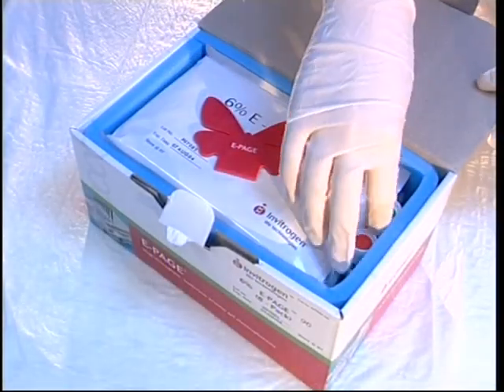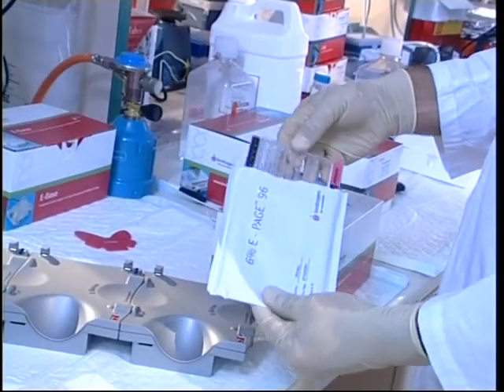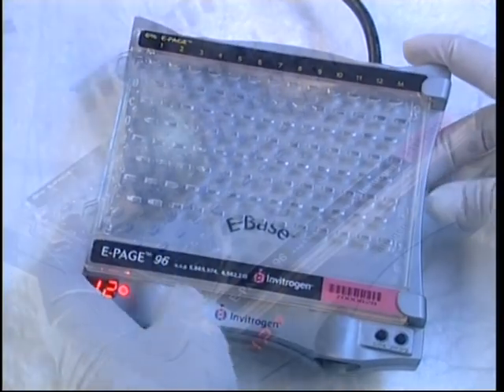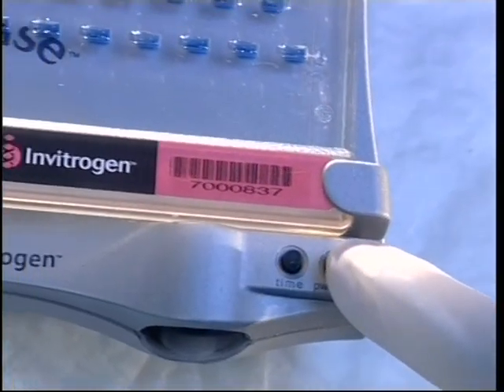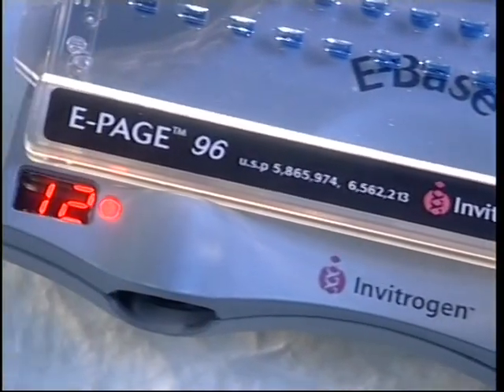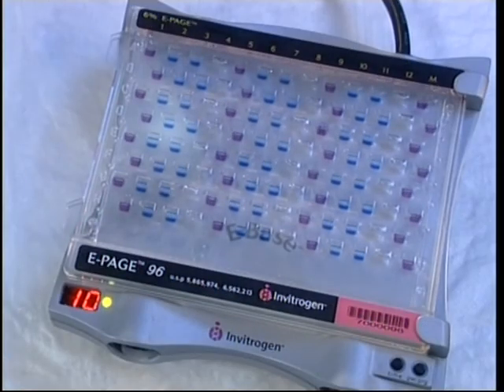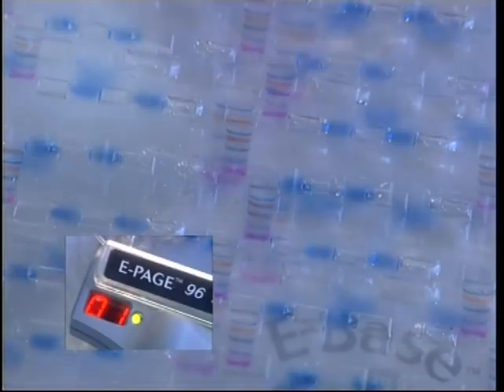Using ePage is safe and easy. Gel cassettes are inserted into the eBase, samples are loaded, and the appropriate program activated. That's all. No running buffers or tanks are needed, and no external power supply either. Just 14 minutes later and the separation is complete.